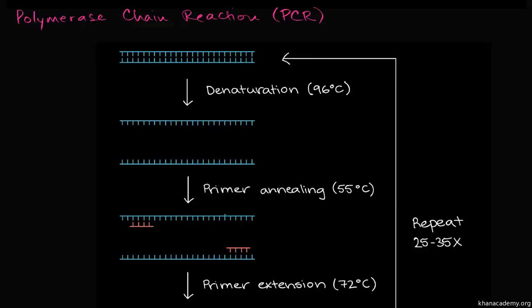I'm here with Emily, our biology content fellow, to talk about PCR, or polymerase chain reaction, which you've actually done a lot of. Why have you done PCR? PCR was kind of the mainstay of my graduate project where I built all sorts of different recombinant DNA molecules and used them to learn things about plants.